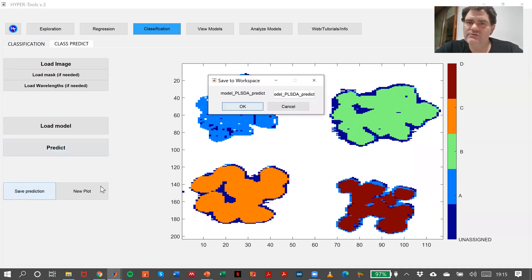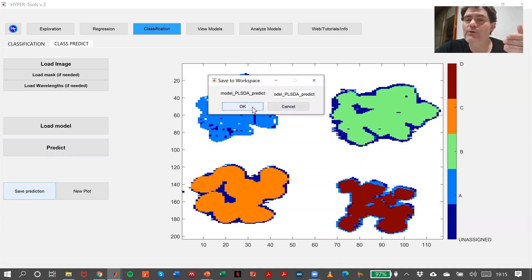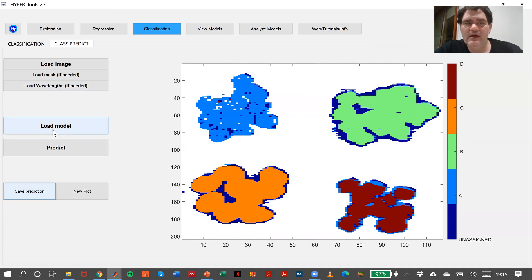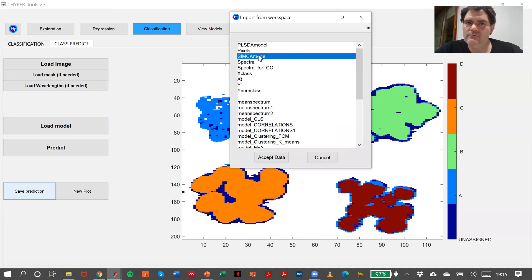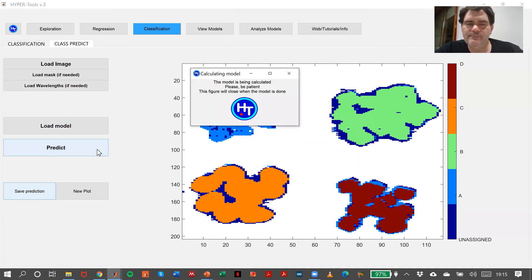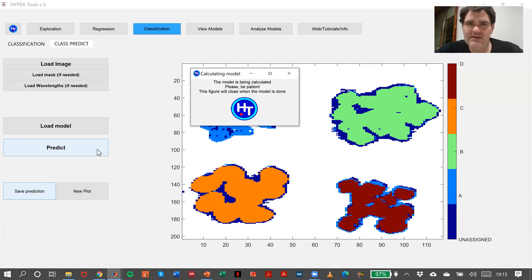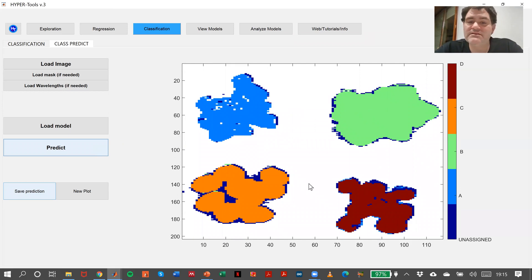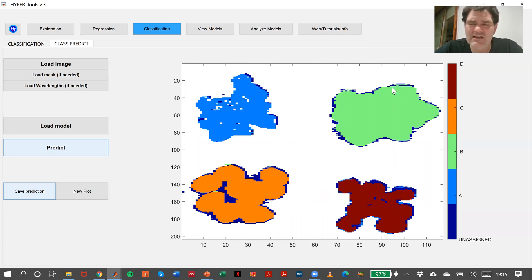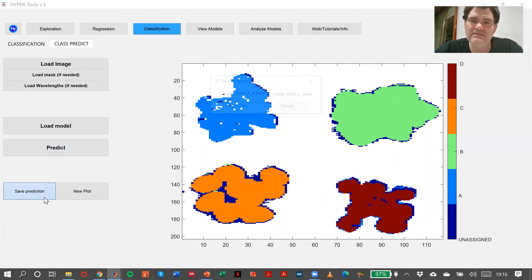Now I can try to see what happens with the SIMCA model. Accept data and predict. It takes a little bit more because we have to check with the three PCA models in SIMCA. This is the SIMCA model result. As before, we have A, B, C, D, and unassigned. In this case, there are fewer unassigned pixels, and you can see the unassigned ones appear at the edges of the plastic, which makes a lot of sense. So I can save this prediction as well.